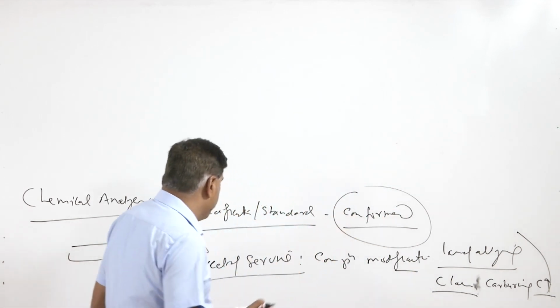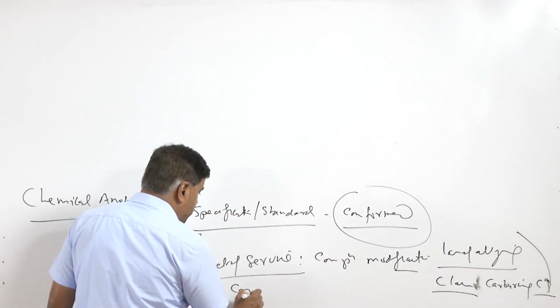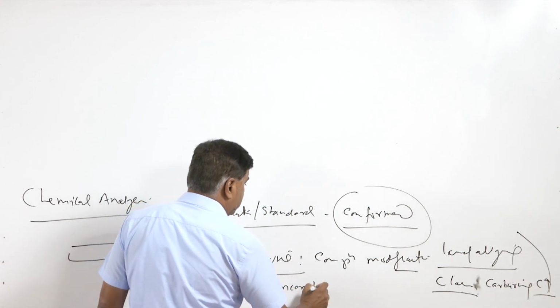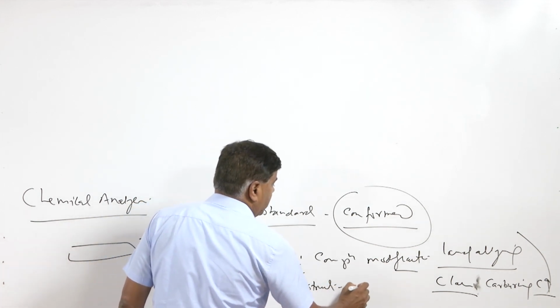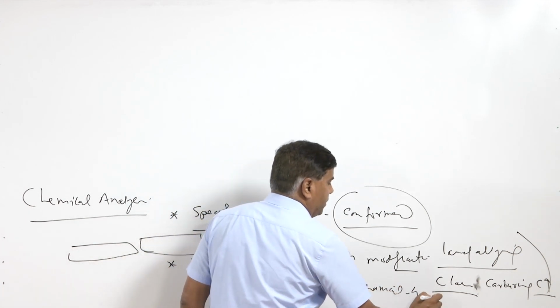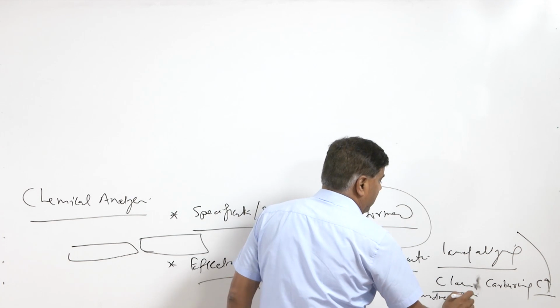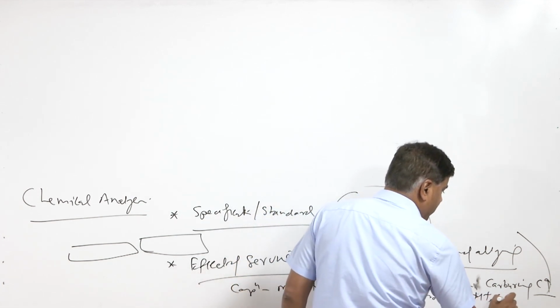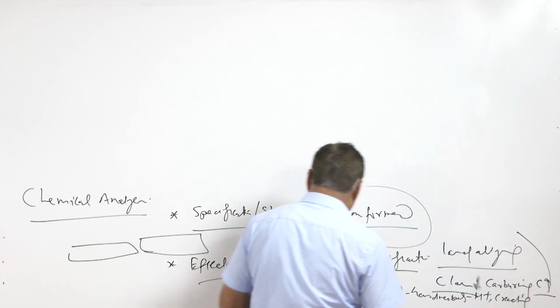And we know that since the composition affects the microstructural aspects of the component, which in turn affects the mechanical properties, it also affects the hardenability and response to heat treatment and cracking tendency. All these are affected by the chemical composition.